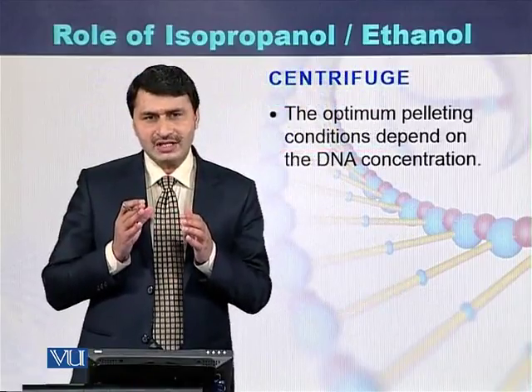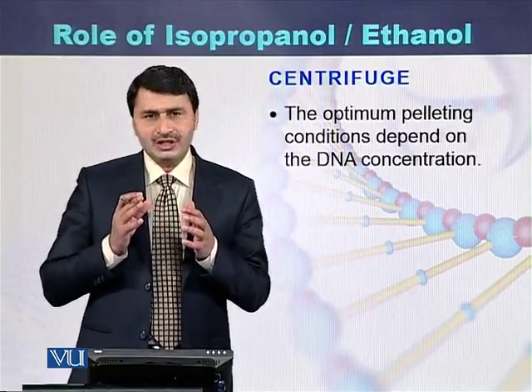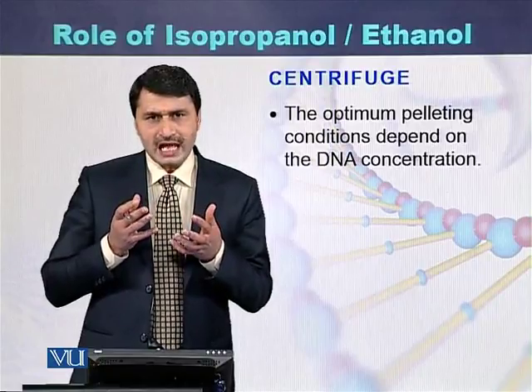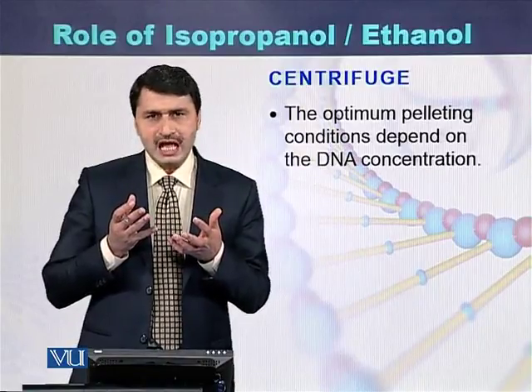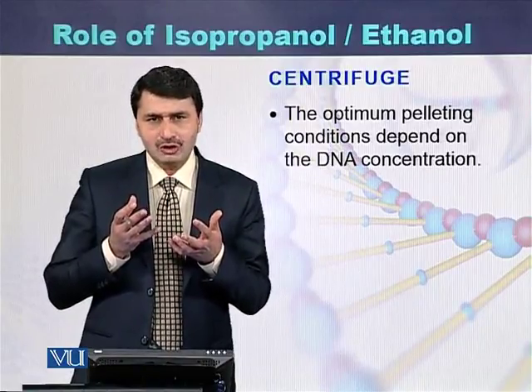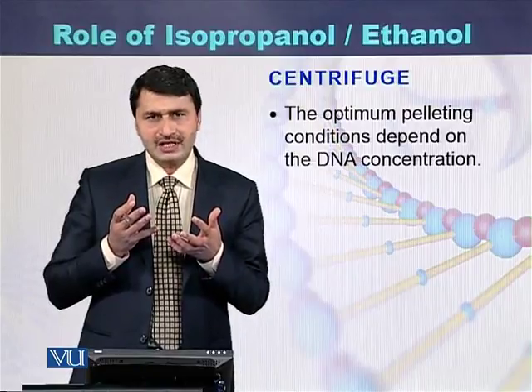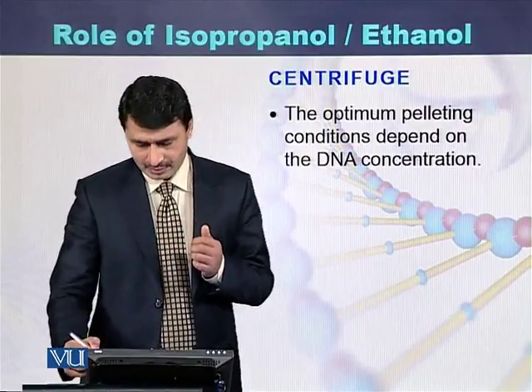Centrifugation also has a critical role in precipitating the DNA. It depends on the speed of the centrifuge: at certain steps you need a higher speed, and at certain steps you need a lower speed. So centrifugation also has a critical role in pelleting out the DNA.